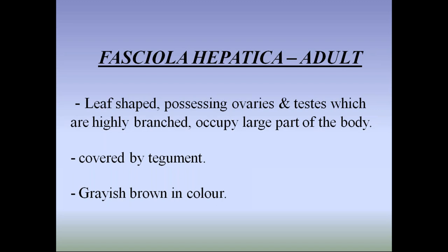It is covered by a tegument, and it is grayish brown in color and leaf-shaped. My important point is the leaf shape. It is large in size and brown in color.